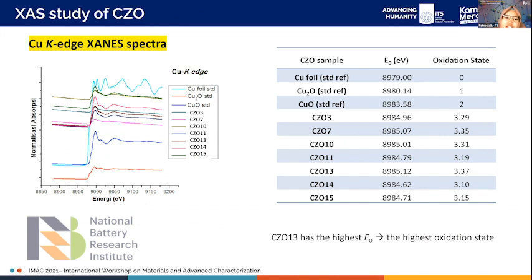And the next one is in copper doped zinc oxide. We do the same analysis and found that the highest oxidation state was found for the CZO13 sample.